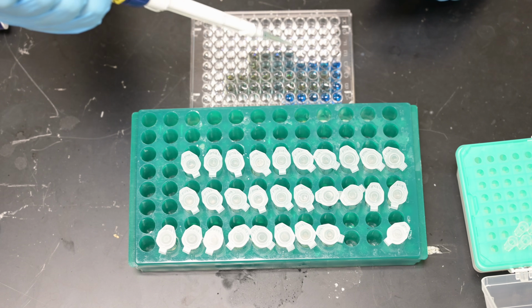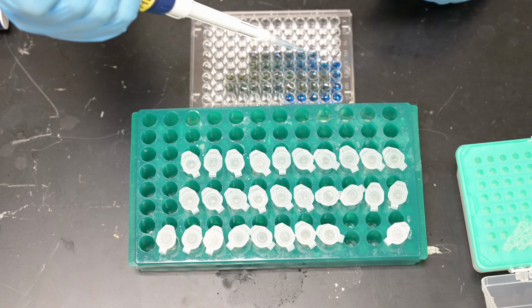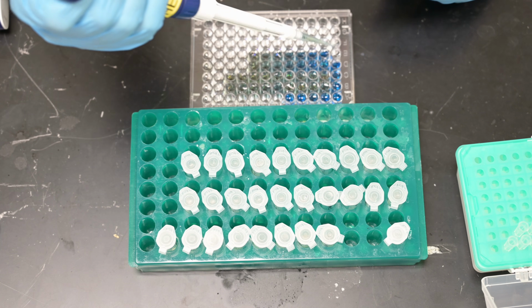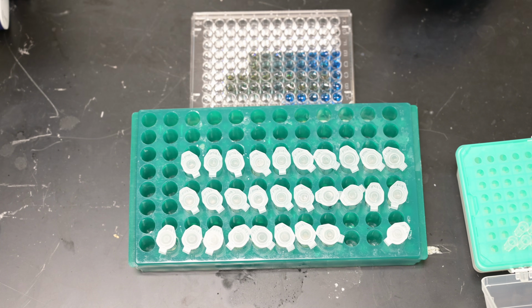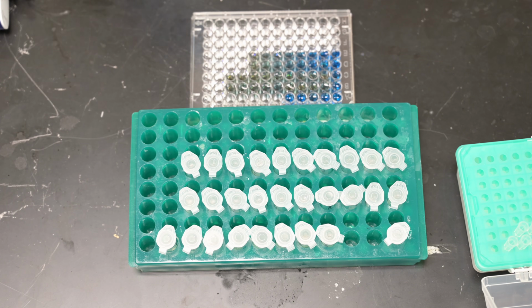You guys will be using BCA. BCA basically is this. You do the assay the same way. You're basically adding 200 microliters of the reagent to the well. So this simulation is very good.